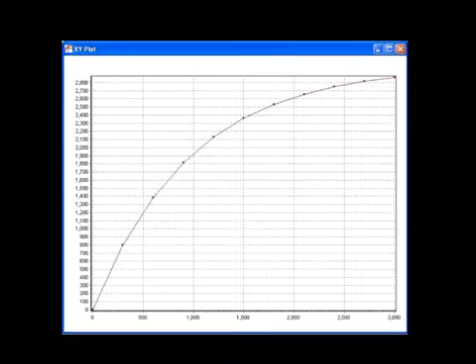the right order of magnitude for these buildup constants and be able to look at these curves. It'll display a fit on the screen, but it's good to be able to see this pretty quickly. So if this is 2,200, then half of that is 1,100 seconds. So what's that in minutes? What did you say earlier? On the order of 20 minutes. So that's pretty good, as long as you're not way off with your prep.